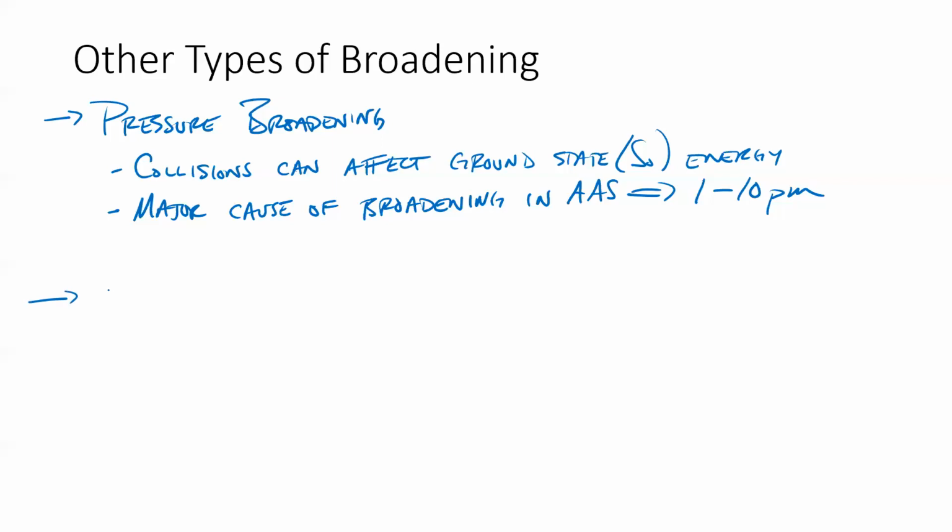The other type of broadening is magnetic. This is sometimes called spin orbit effect. I don't know how much Dr. Arrington covered this in PChem 2, but it's a very PChem 2-y thing. Right?